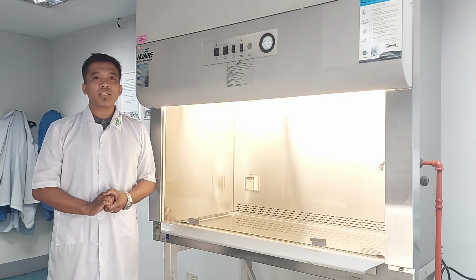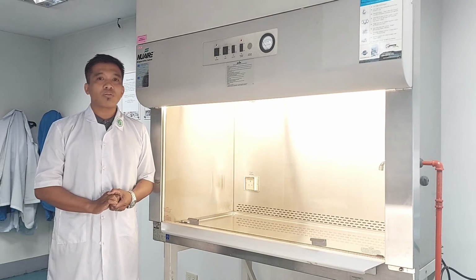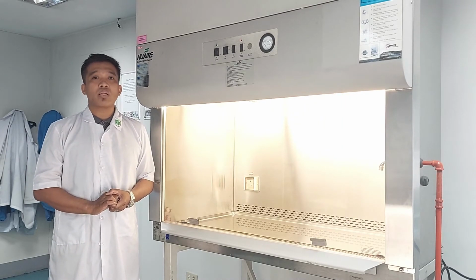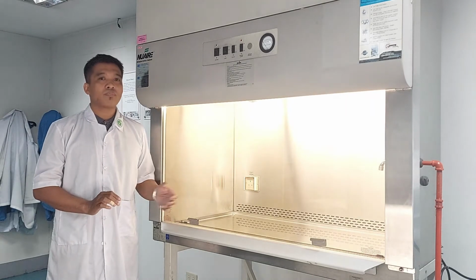The use of a biosafety cabinet or other physical containment is not required in biosafety level 1, but depending on the risk assessment, some processes might require such containment. Besides, most BSCs also function to sterilize biological materials that are kept inside the cabinet.